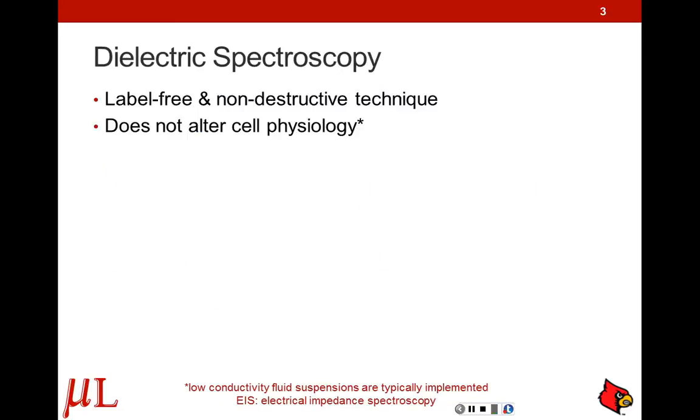This is where hopefully we can improve upon this, because these dielectric spectroscopy techniques in general are label-free and non-destructive. You could potentially do a cell sorting technique downstream. Also, it does not alter cell physiology. I say this because in most cases you have to put the cells and particles in a low conductivity solution, but typically it's for a limited amount of time.